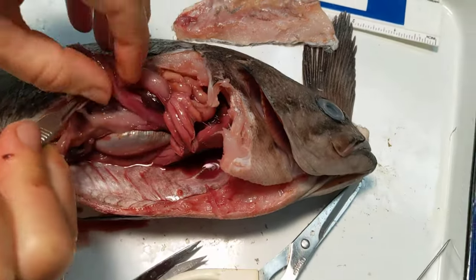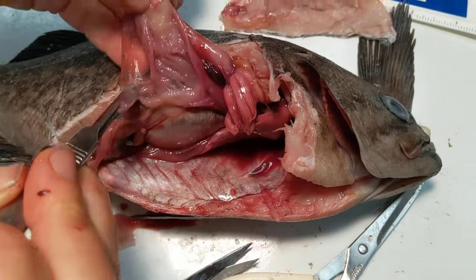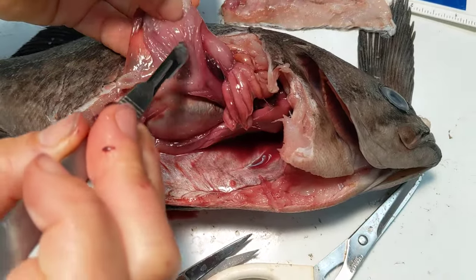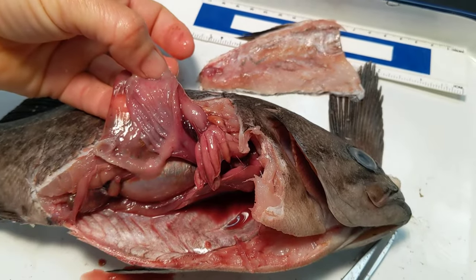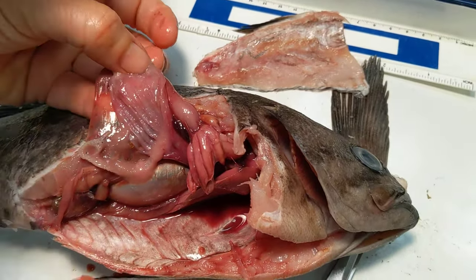We just see some digested matter. But one of the things you can see are those folds in the stomach, increasing surface area — so lots of digestive juices out there.